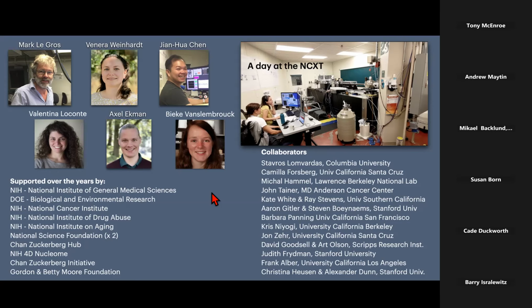The other thing I'm seeing, at least I didn't notice any ribosomes. That's typically the thing that they all show when they do cryo-electron tomography.